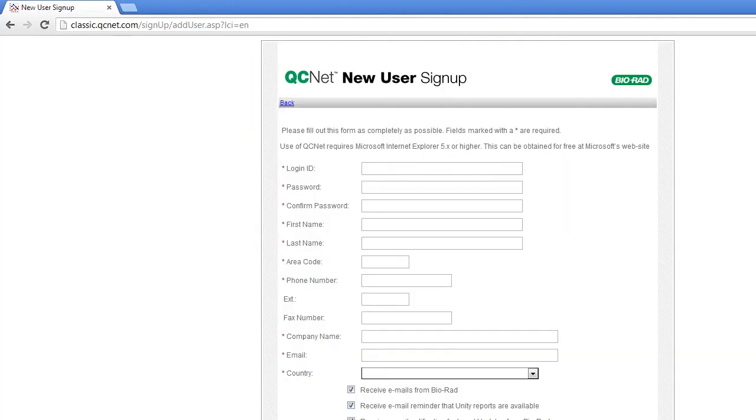Completing this registration gives you access to QCNet. After purchasing the software, Biorad associates your primary user with a lab number. This allows them to assign access.